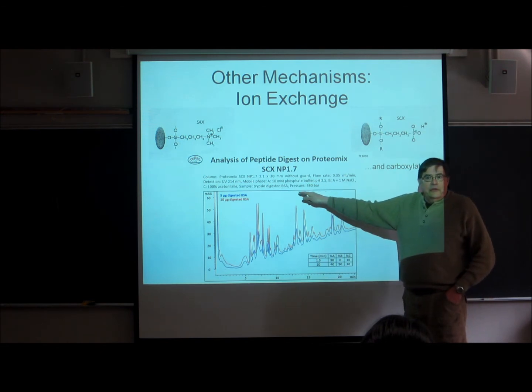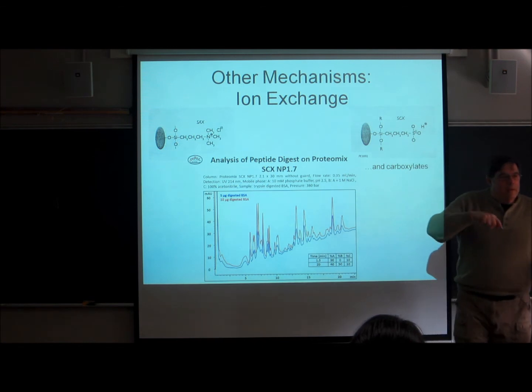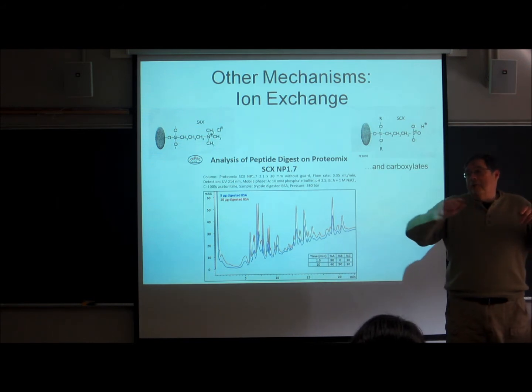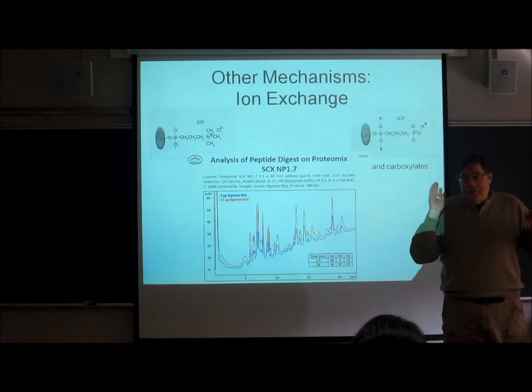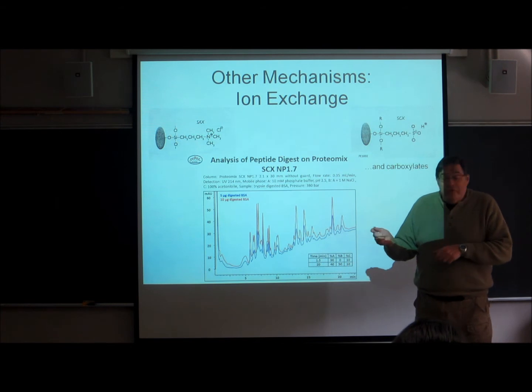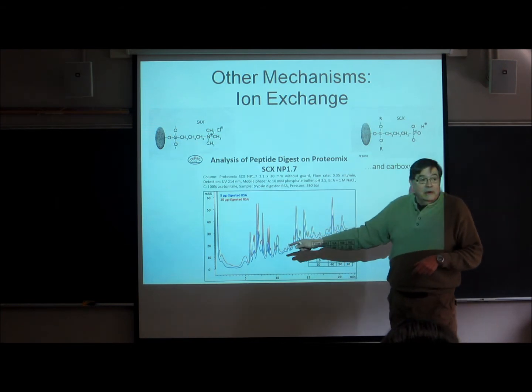It digests BSA. It looks along the chain of the peptide for lysines and arginines, and it will lyse those points. So what you get from a long peptide chain that's been treated with trypsin is a collection of small chains of amino acids. And those small chains then can be separated on a column.